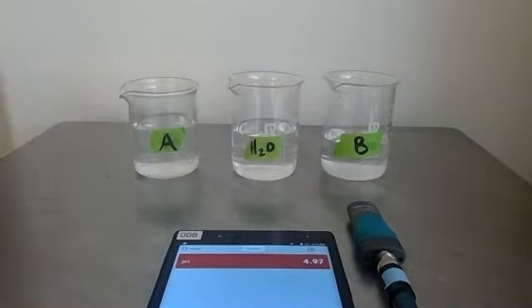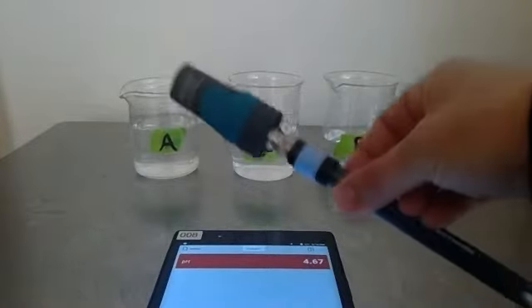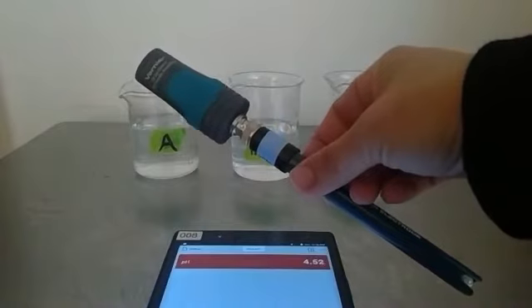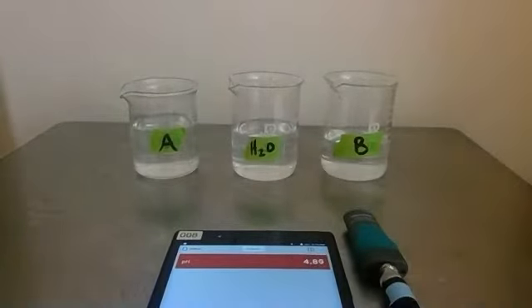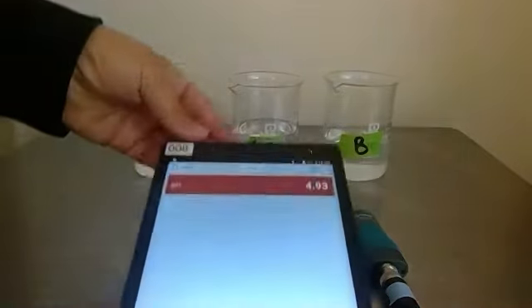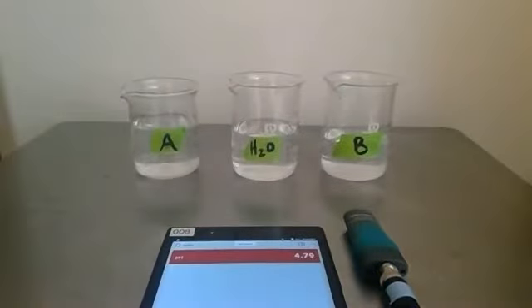We also have to look at the pH of a solution besides a visual cue. We have a pH sensor. These are the Vernier Lab pH sensors that we use and it's paired with a tablet that right now is reading the pH. I'll put it up like this. Right now it's reading about 4.8 but that's because it's in air and it's probably freaking out.